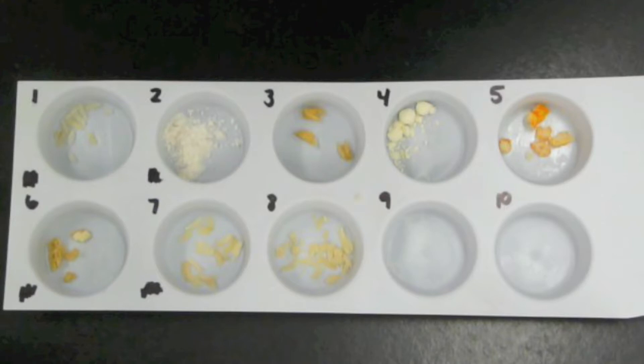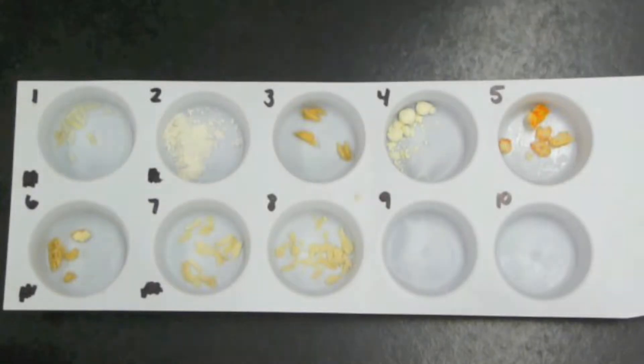In this lab we will be testing different foods for protein. Once again our test material is going to be kumasi blue powder or protein test strips. The first thing we are going to do is soak these foods in water.